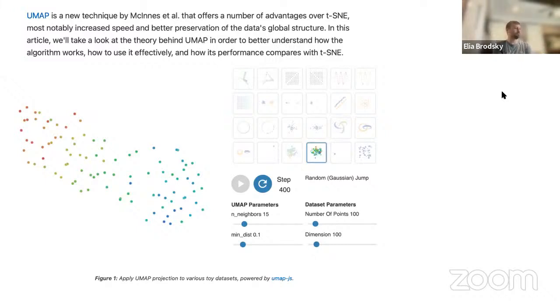Exactly right. Okay, so we talked here about t-SNE and UMAP, these traditional figures that we always expect to find in single cell data. And we understand that parameters make a big difference, oftentimes counterintuitively, right? Counterintuitively means that the simpler the data, the clearer the separation.